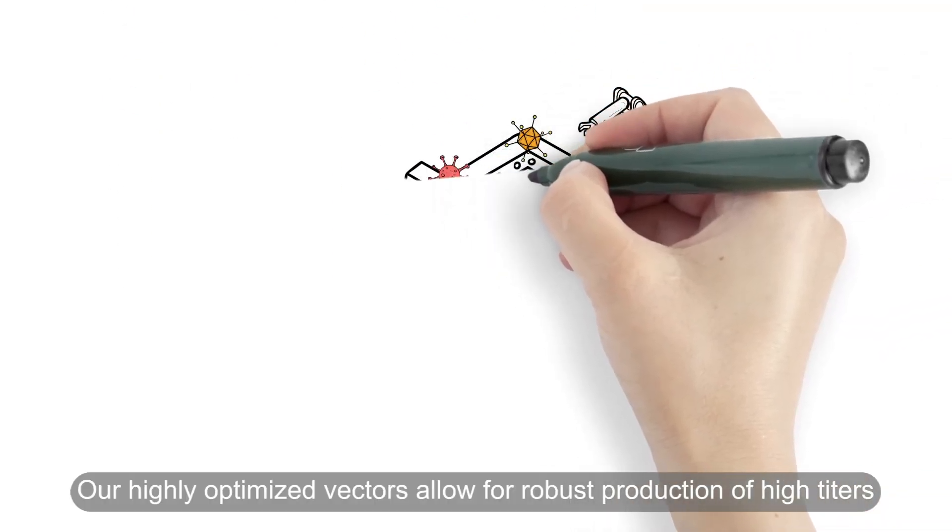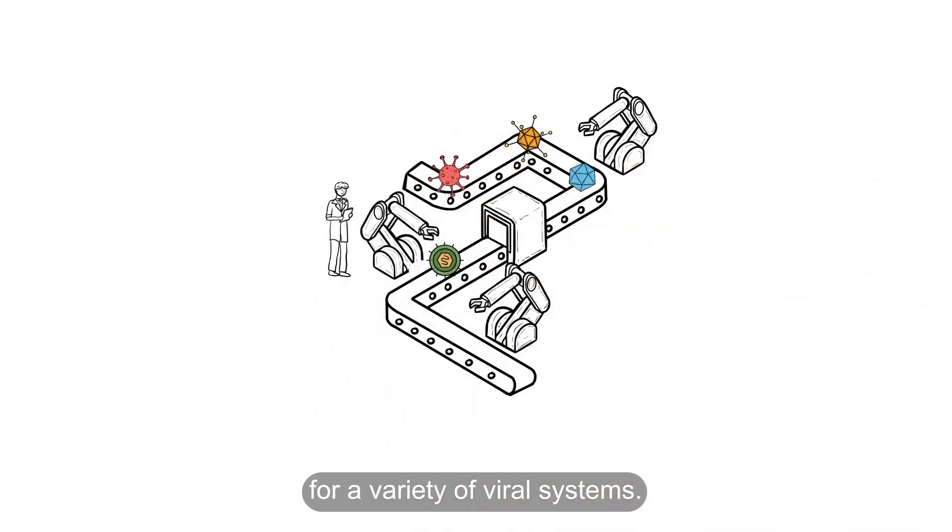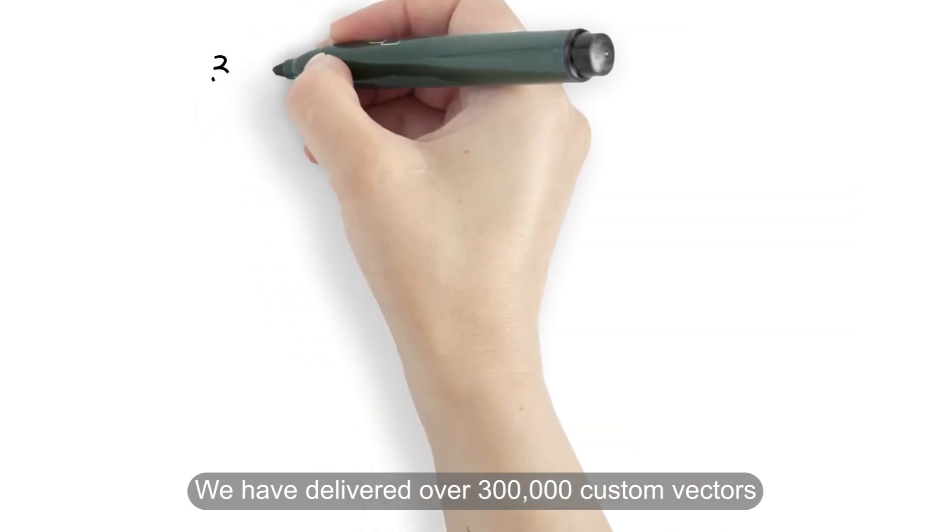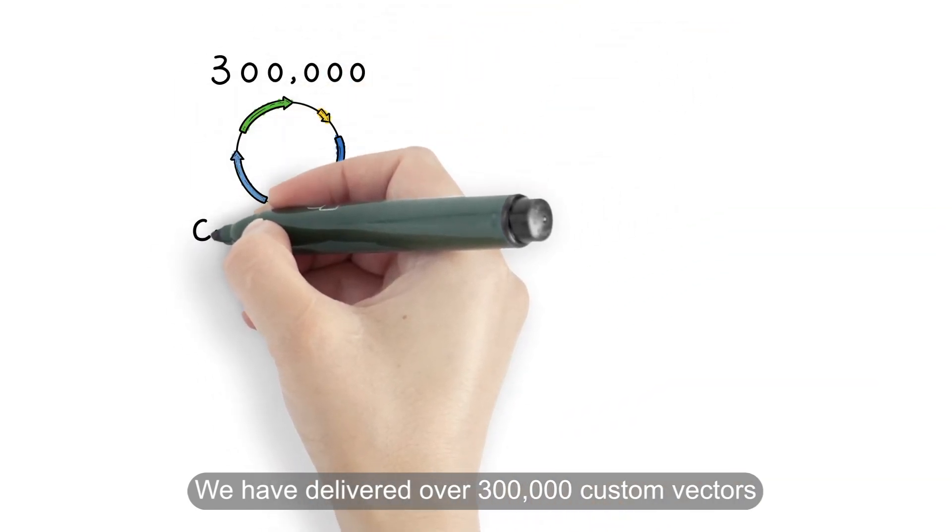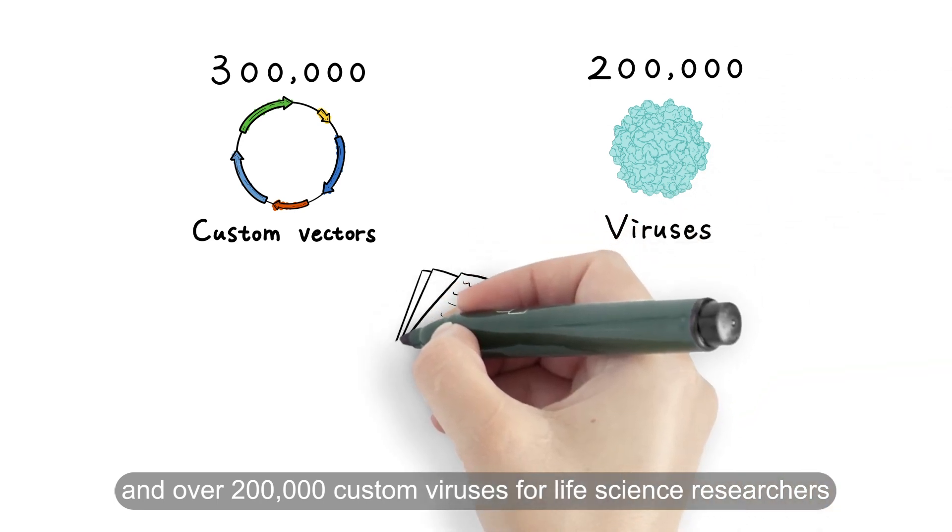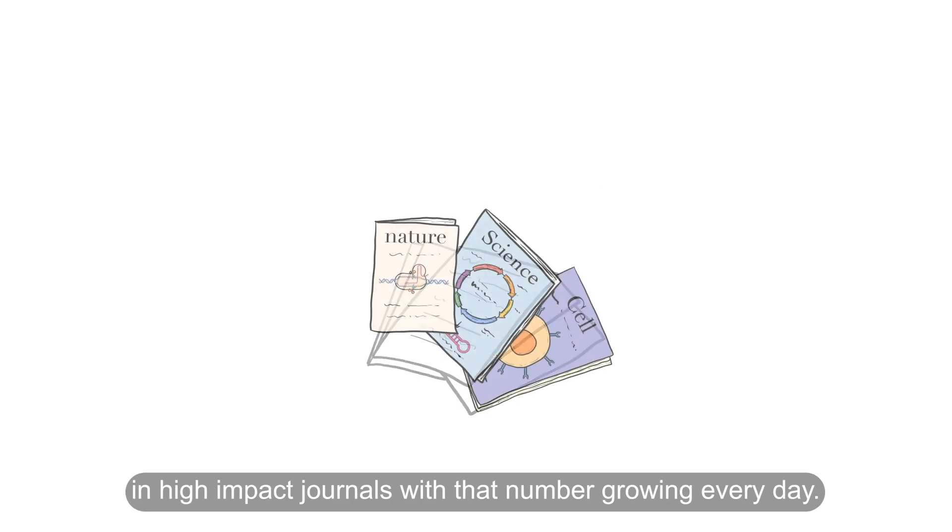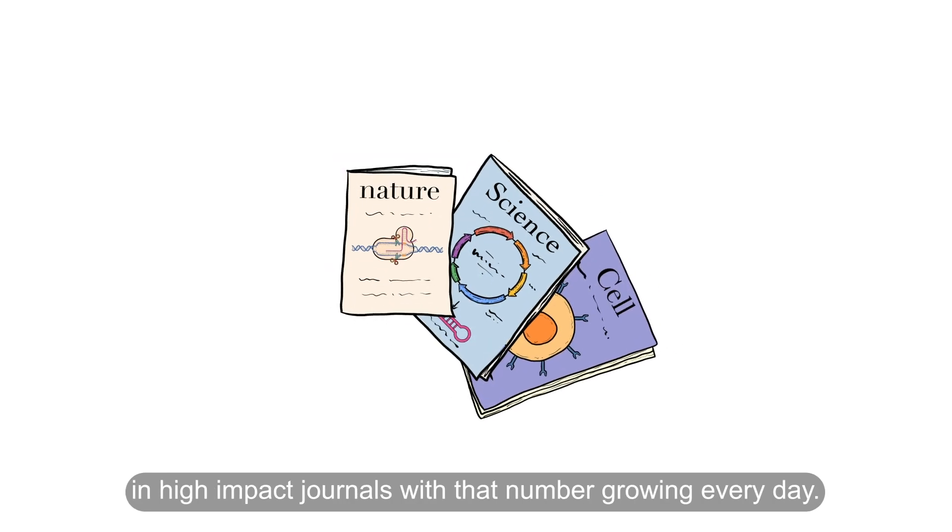Our highly optimized vectors allow for robust production of high titers for a variety of viral systems. We have delivered over 300,000 custom vectors and over 200,000 custom viruses for life science researchers, and our impact can be seen in our thousands of citations in high-impact journals, with that number growing every day.